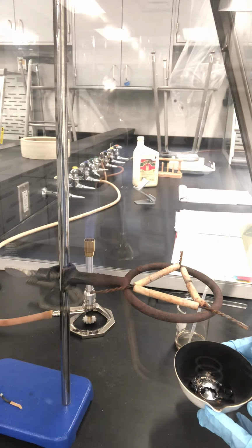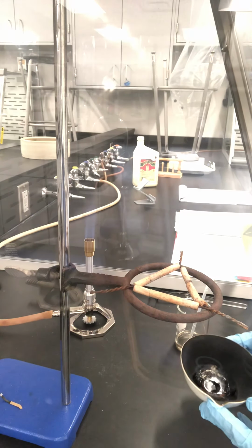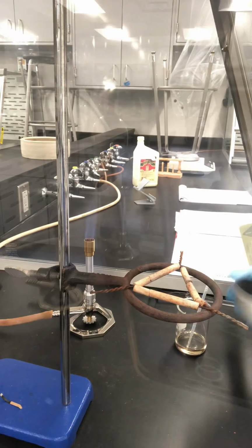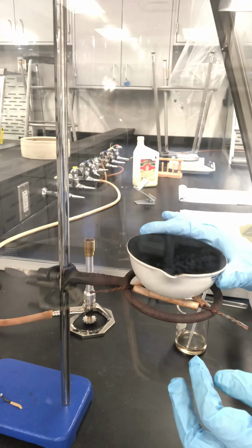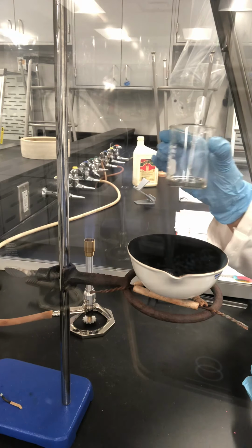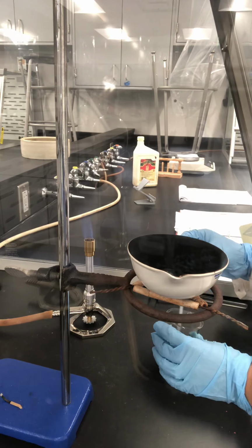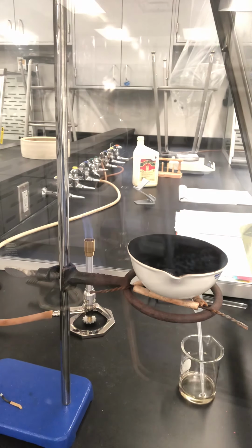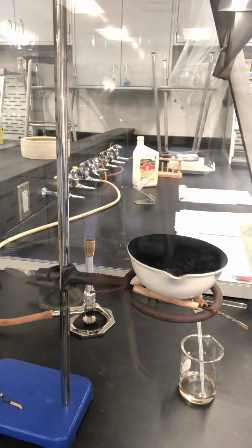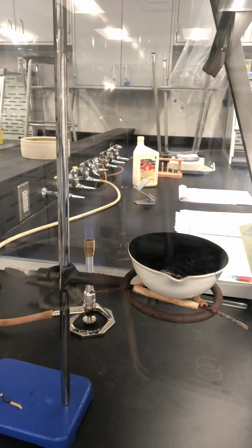or 8 drops of sulfuric acid. Now this is concentrated sulfuric acid. Now I will add 8 drops of sulfuric acid into the evaporating dish.